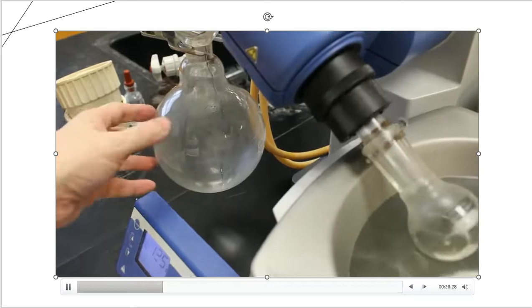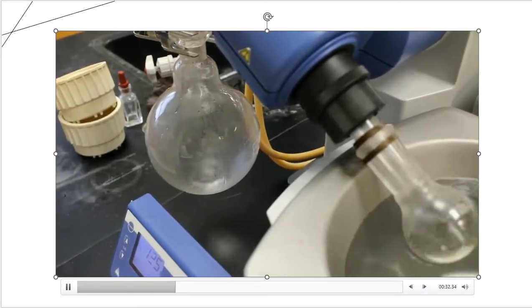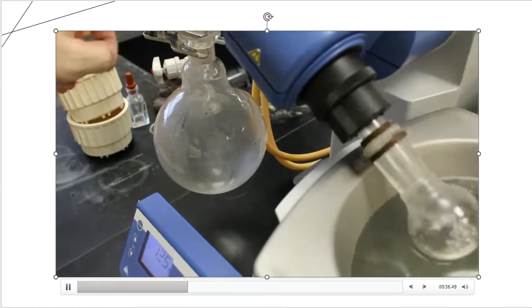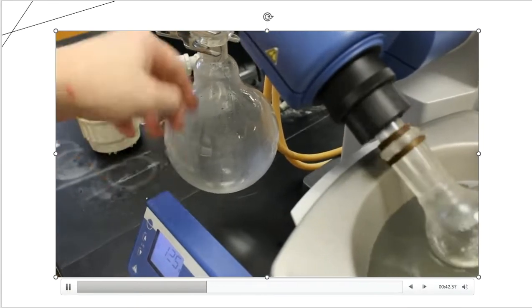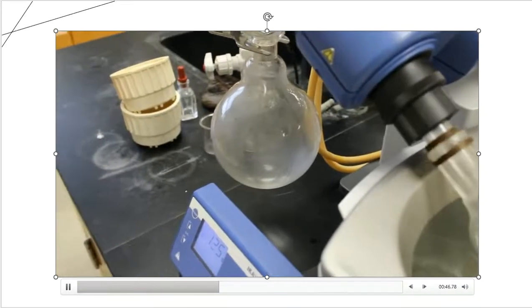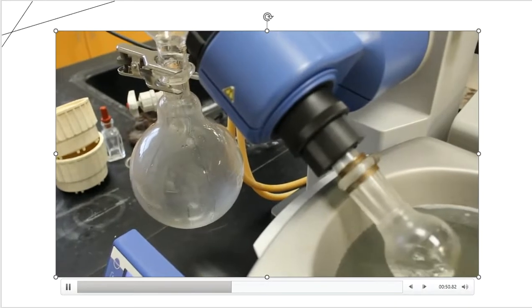And over here to the left-hand side of the flask, you're seeing that that's where the methylene chloride is going. So it's evaporating, it's leaving, and over here in this compartment, it's condensing because there's a condenser on that side, and all of that methylene chloride is getting saved into that flask, which we call the receiving flask, to the left-hand side.